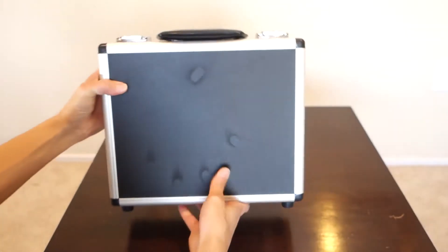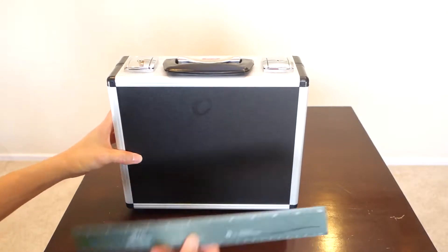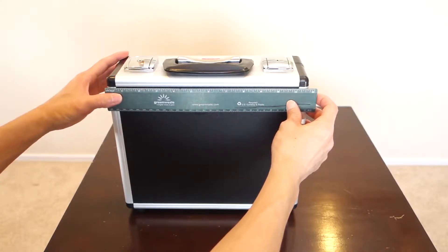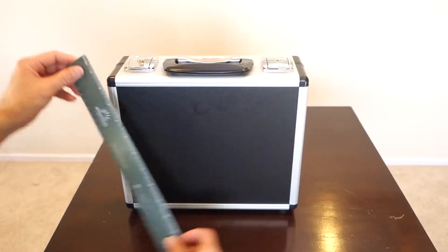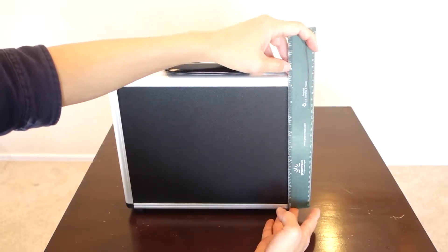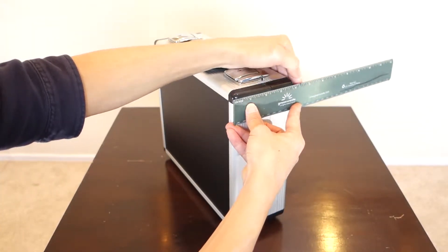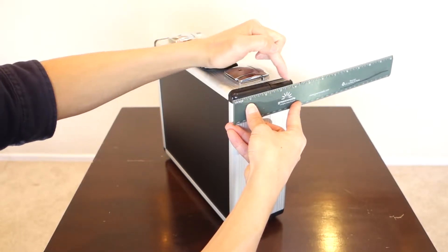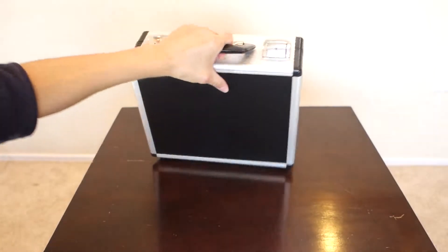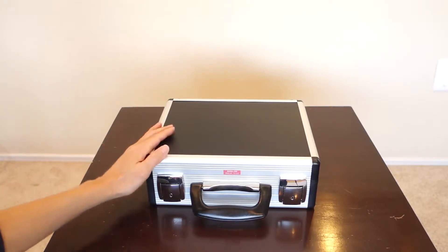You can get some data from there. Before I open this up, I want to measure how big this box is. From side to side, it's not quite 12 inches — about 11 and a half inches — by about 9 and a half inches, not quite 10. And the depth here is around 3 and three-quarters inches. It's a very sturdy case, almost like a safe deposit box where you keep all your valuables.